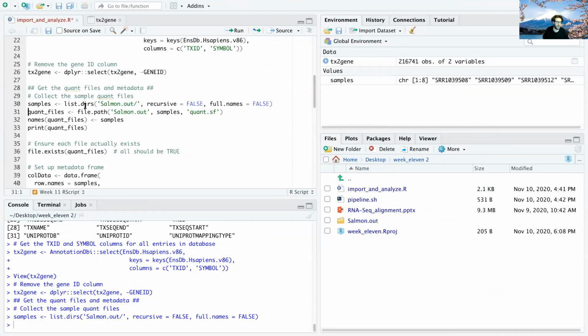And just to be clear, while he's running that, what he showed you on the server, we did that for all of these samples individually. So if you wanted to do all of these yourself, you'd have to go back and run all of that command he showed you on the server for each of these samples. Right. And then download it. Yeah. Okay.